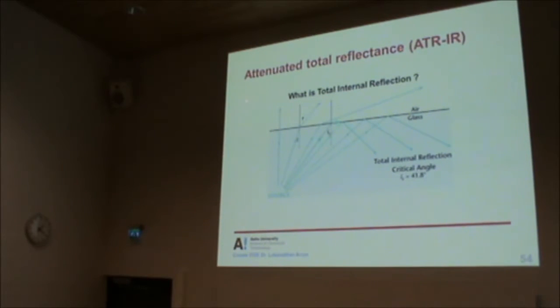The technique is called attenuated total reflection, ATR. And the whole process is dependent on total internal reflection. You have seen this principle in surface plasmon resonance, but we'll go through this again. Here the only difference is there is no plasmon, it's just an interface.